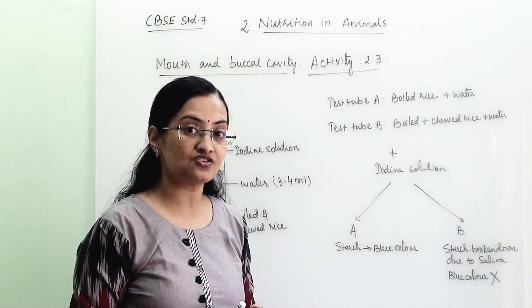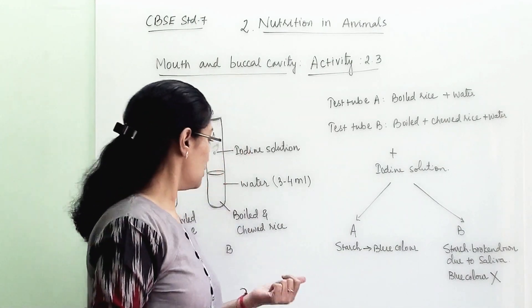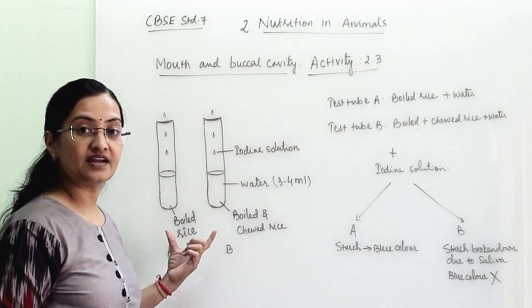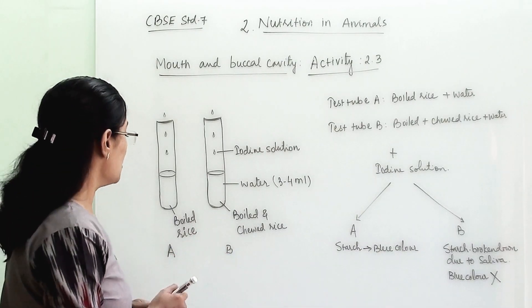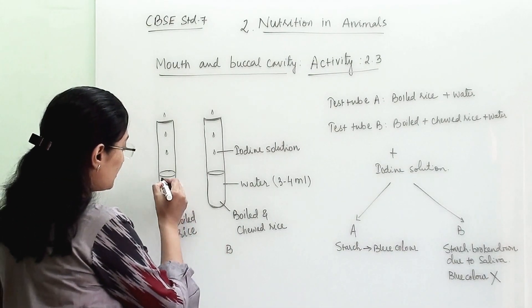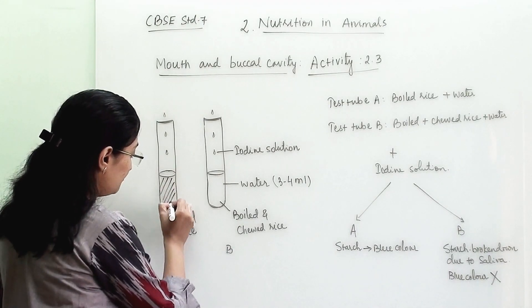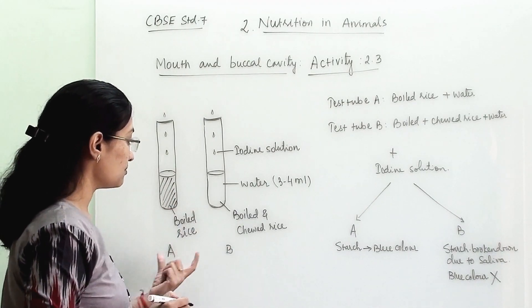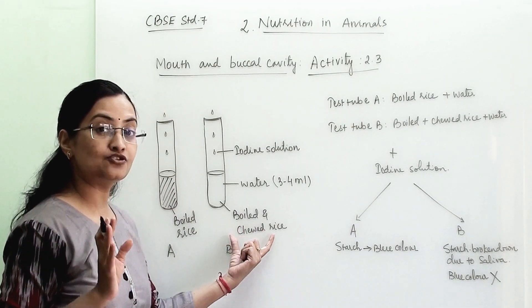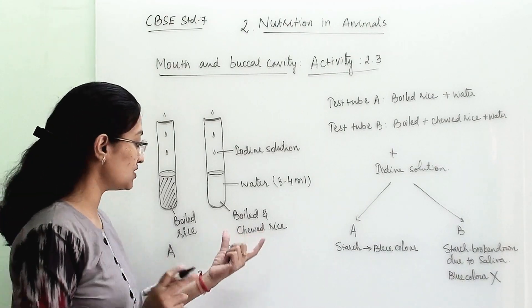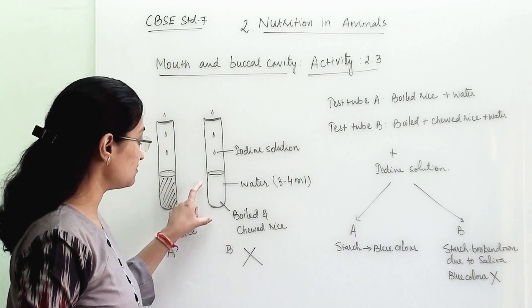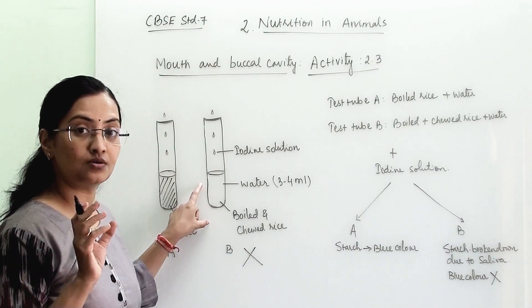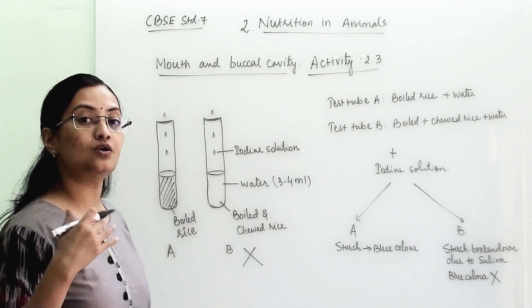Similarly, we are checking the presence of starch in boiled rice. So in both of these test tubes, we are adding 2 to 3 drops of iodine which will act as an indicator. Here, the rice which are boiled will show us blue color, but the rice which are boiled and chewed, which has saliva mixed into that, it will not show us any blue color.